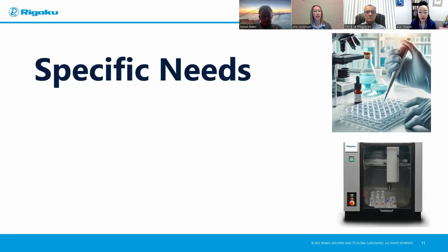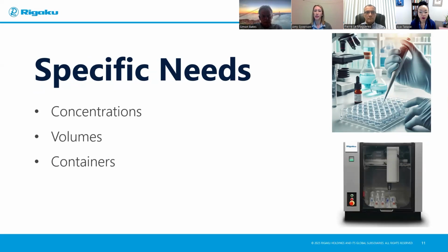When you're running experiments, either by hand or if you're using a liquid handling instrument, it's very important to plan ahead. You will need to know the exact concentrations of the solutions you're using, the volumes of each of those solutions, and if there are any specific container requirements or any additional supplies that are needed. This is the time to make sure that you're ready to go. The timing matters a lot with a lot of the experiments that you're running, and just a little bit of prep work ahead of time is going to save a huge hassle later on.